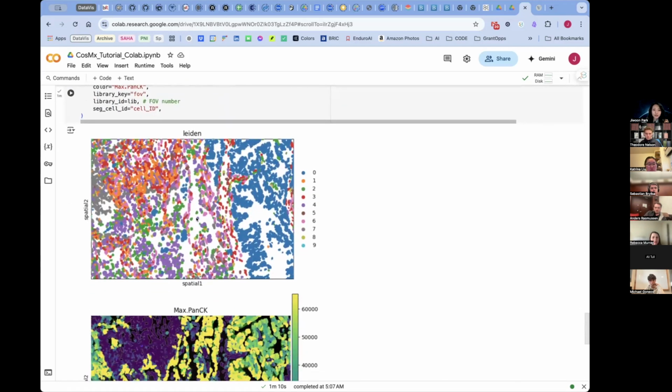There are different statistics like Moran's I and Ripley's K to understand how closely, for example, these zero clusters are clustered together, or how far apart. What are the spatial correlations of expression between cell 0 and cell 1 that are spatially quite distinct? That is very distinct from the expression level analysis.